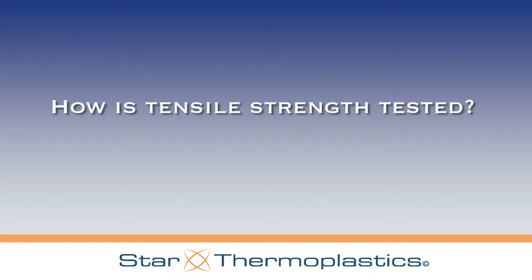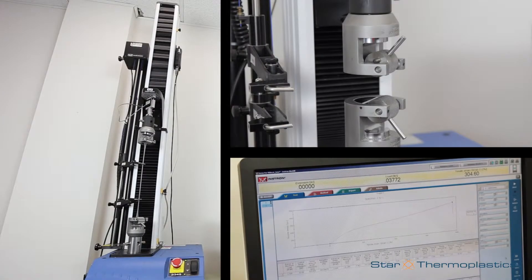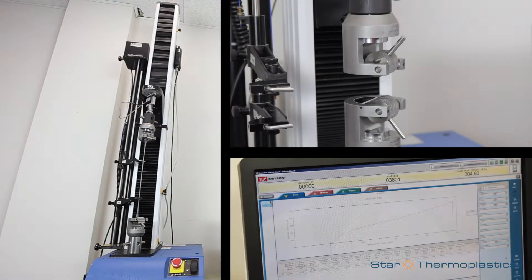Let's take a look at how tensile strength is tested. Here's a tensile testing machine from one of our five laboratories. In order to perform the test, you will first need the proper machine.